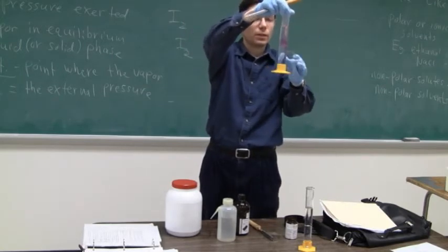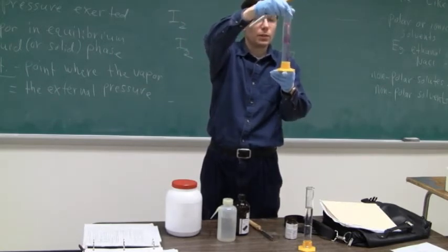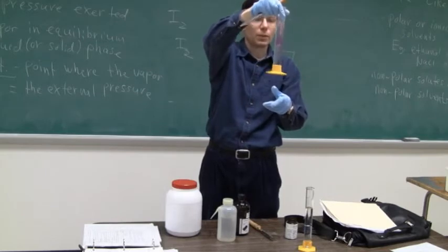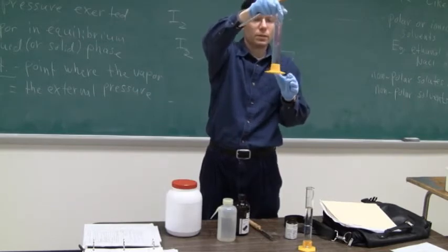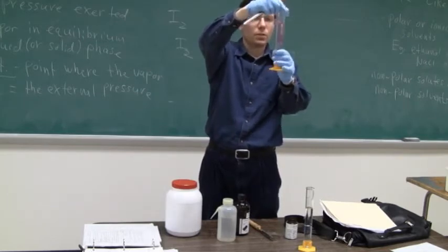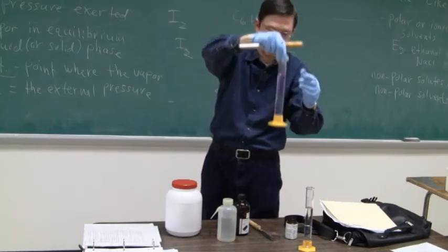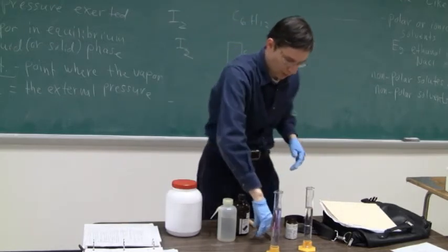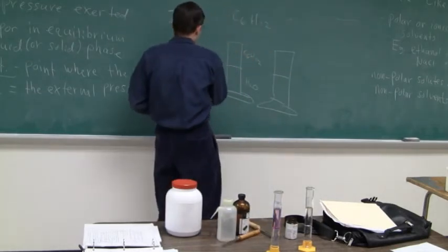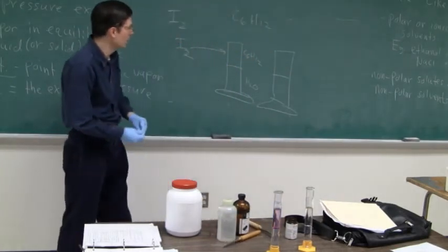So, we get this kind of purple layer. Notice how the iodine is coming back up a little bit. So, we have our purple layer. Guess what? That's where it should be. Pink layer, purple, whatever you want to call it. All right. So, there it goes. That's where it should be.